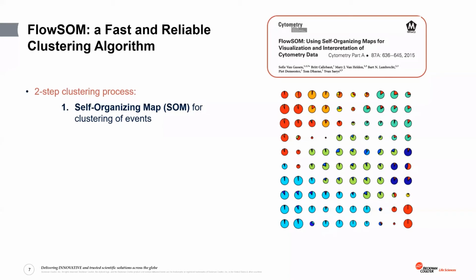Perfect. Thank you, Steph. Okay. Another question. How does FlowSOM compare or work with Xshift? And I will refer this question to Chihao. Yeah, thanks, Alina. So again, there are so many different clustering algorithms available right now, and besides FlowSOM and Xshift, some people also use PhenoGraph.